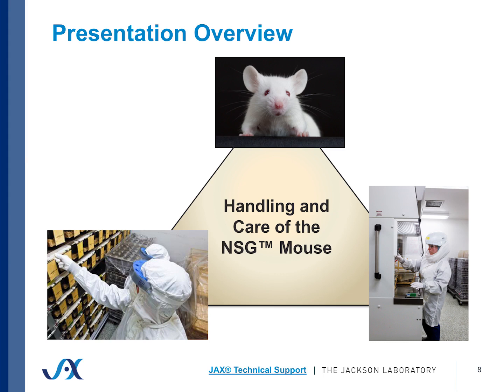And lastly is the environment. Obviously, the habitat, if you will, for where that mouse is living is going to have a profound effect on the health of that mouse and what kind of experimental data you're going to be getting out of it. Where do the cage changes occur? What is the cleanliness level? How often are pathogen tests done? What kind of sentinels are you using? All of these are considerations that may affect what kind of data you're going to be getting out of that mouse.